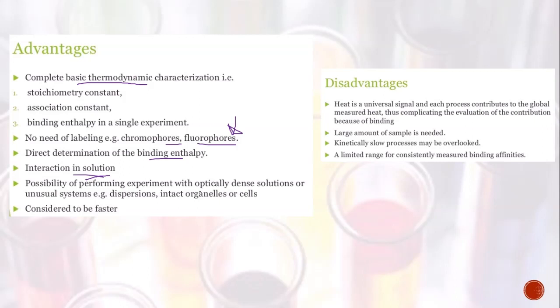Then the possibility of performing the experiment with optically dense solutions or unusual systems such as intact cells becomes very possible. Then you can have this as an advantage because this test is quite fast in terms of determining the binding of macromolecules and their ligands.